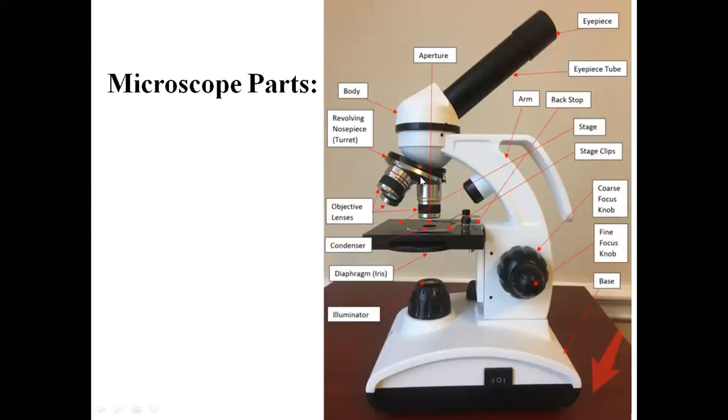This is a rotating device. We can just rotate whether we want 10x, 40x or 100x. According to our requirement, we can rotate this and focus on the sample.